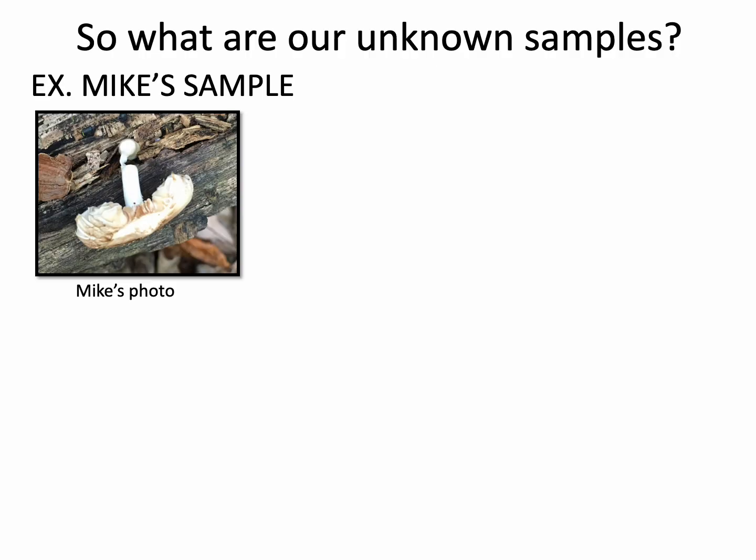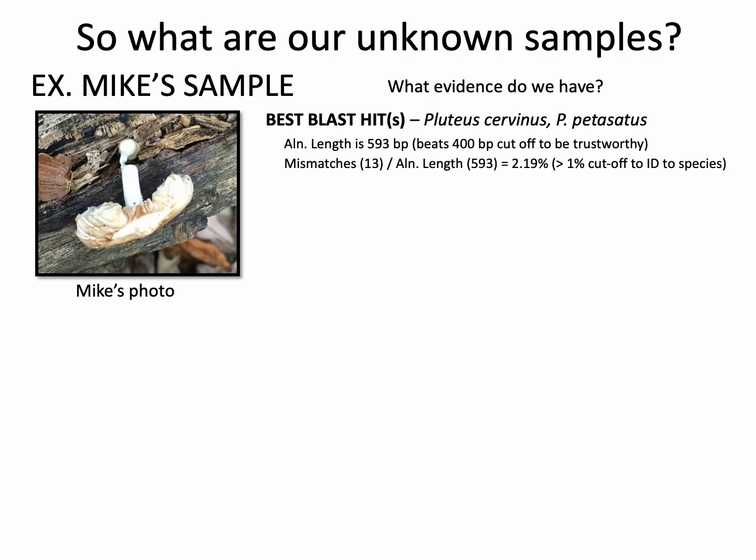All right, so how do we put all of these pieces together to ID our unknown samples? Let's start with Mike's sample. Here's the photo he took from the sample they used to create his DNA barcode. And let's look at the evidence we have from our DNA barcoding analyses. Number one, we have our best BLAST hits.